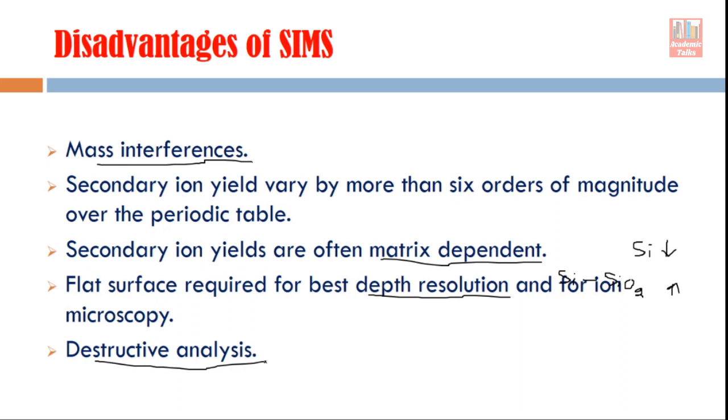I hope that now you understand the working principle of SIMS and what kind of information we can get from SIMS. You know the instrumentation of SIMS, the various important components which are part of a SIMS instrument. You know various mass analyzer techniques. You understand various modes of operation of SIMS, and you also understand the advantages and disadvantages of SIMS. Still, if you have any question or any doubt, you can discuss with me in the interaction.